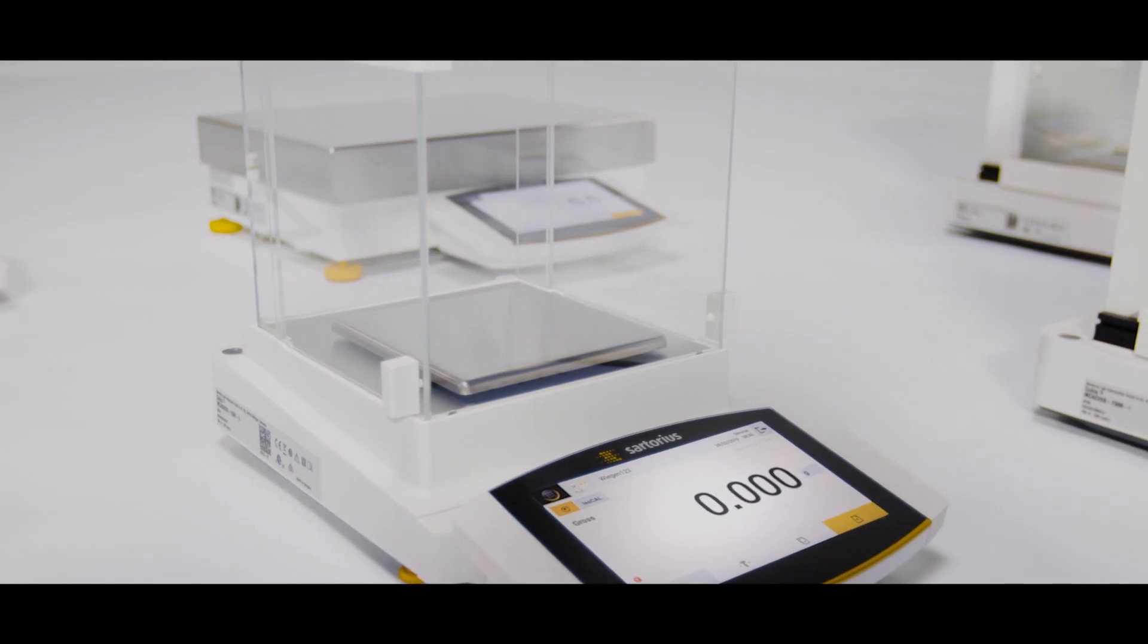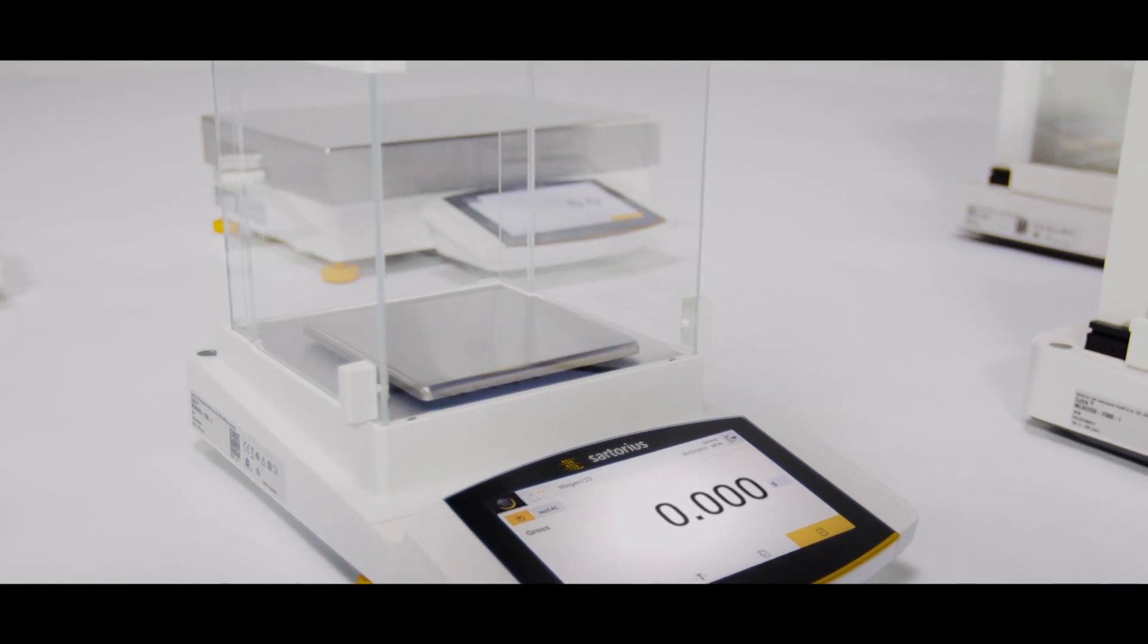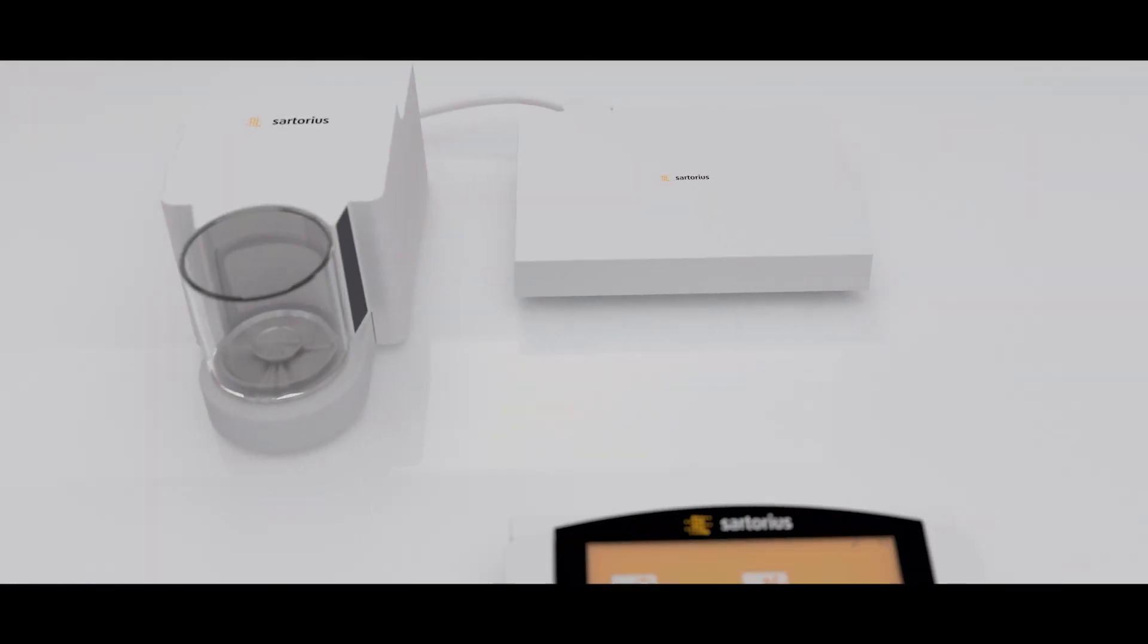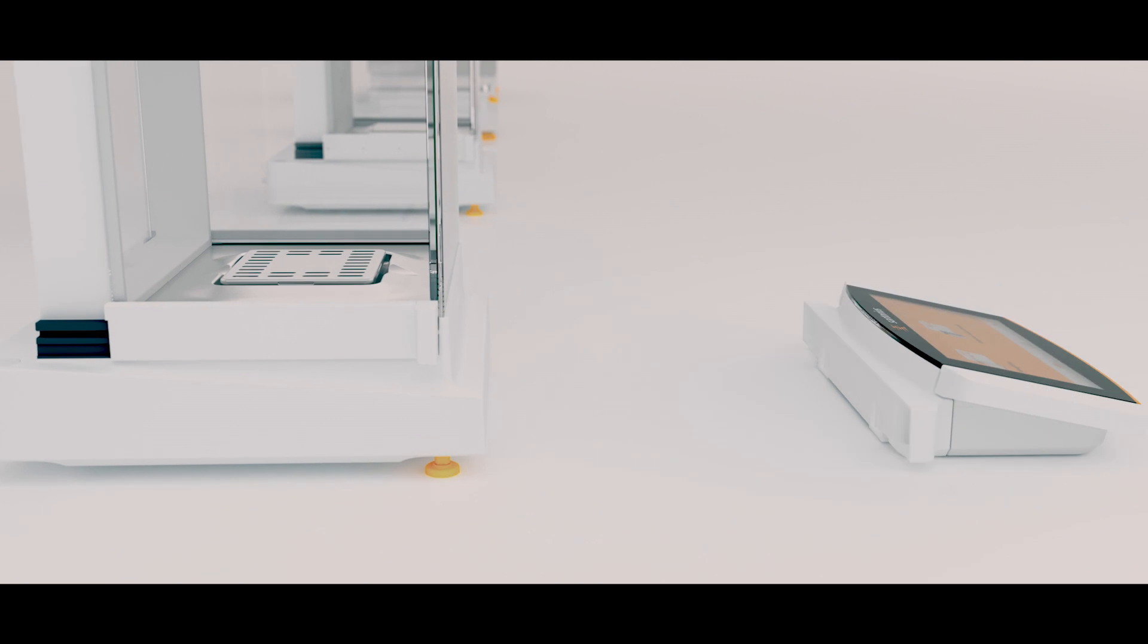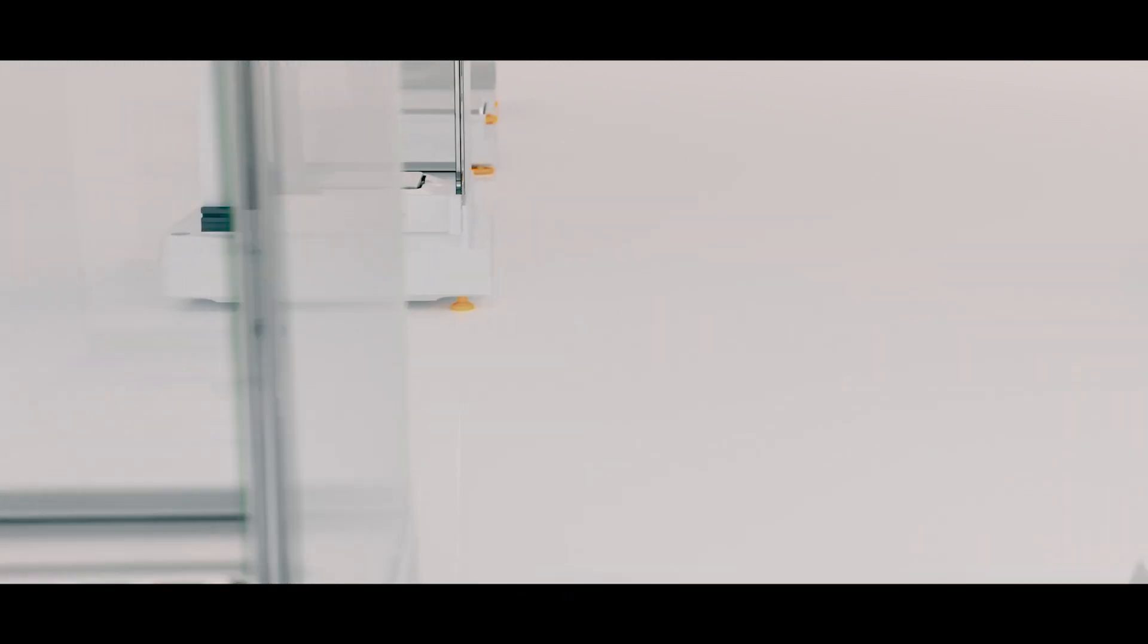Cubis II sets the new benchmark with respect to modularity, connectivity, compliance and workflow integration.